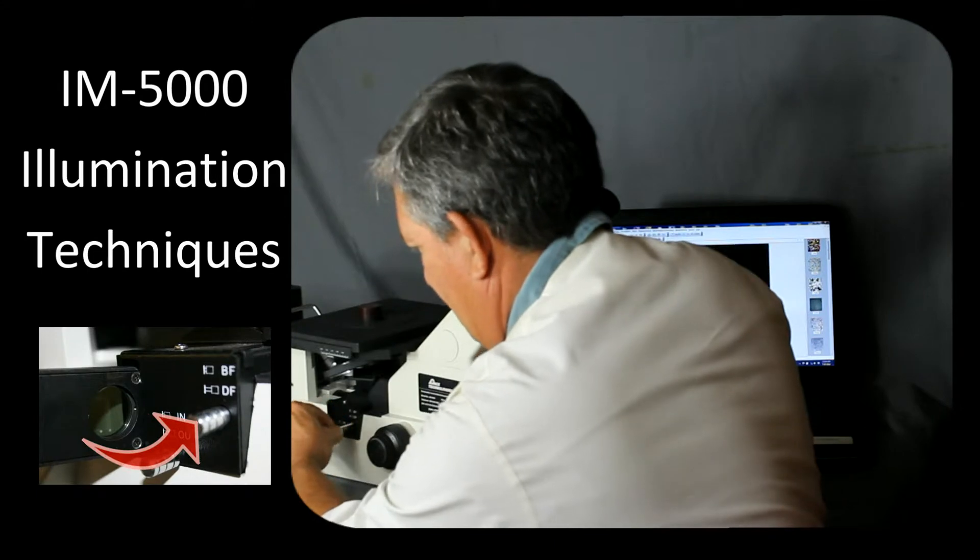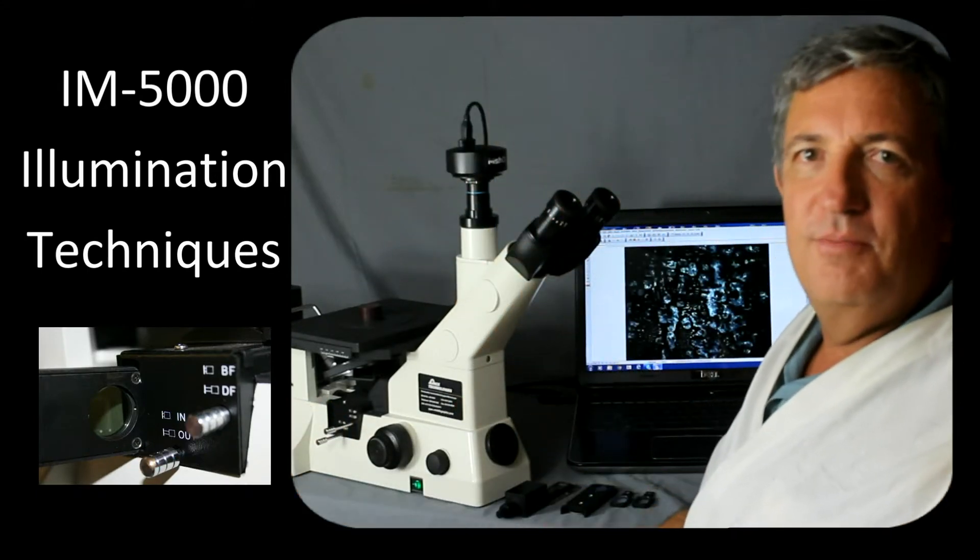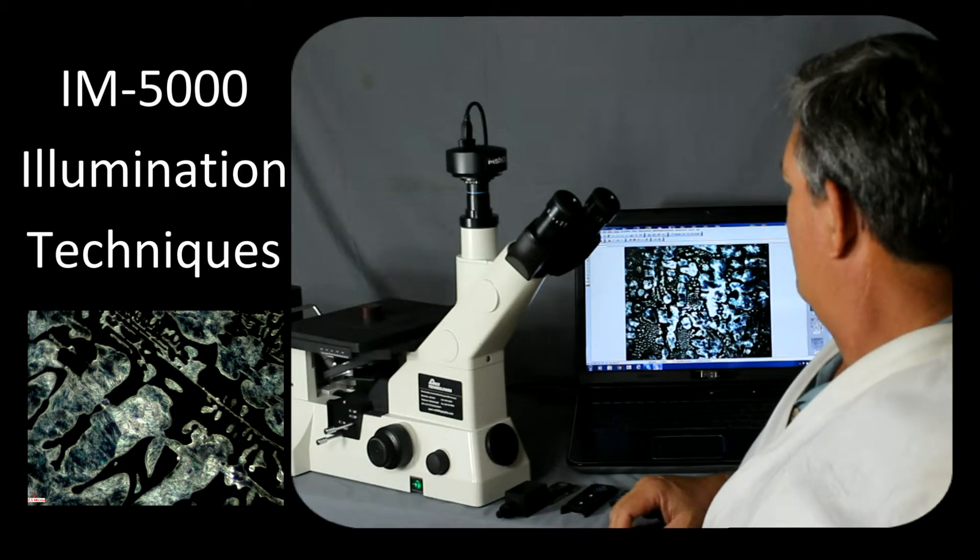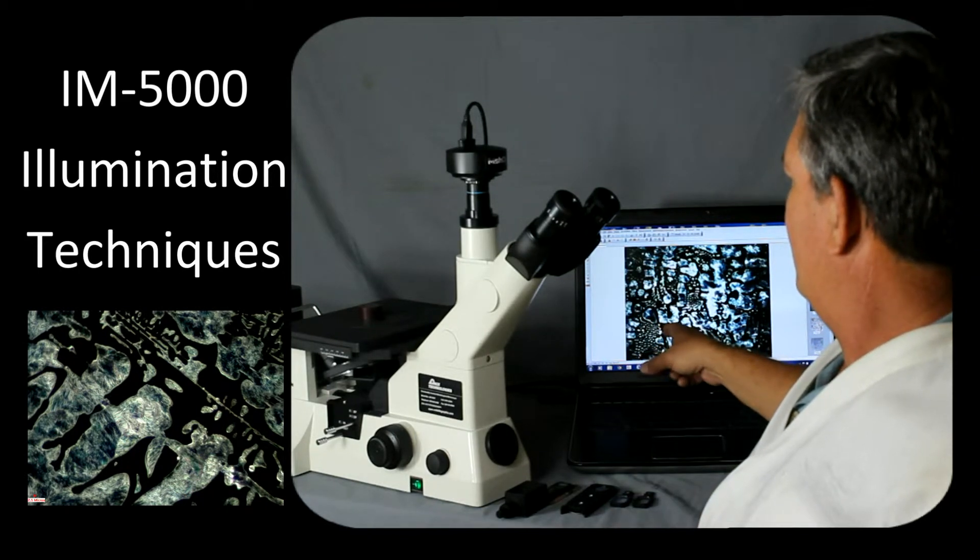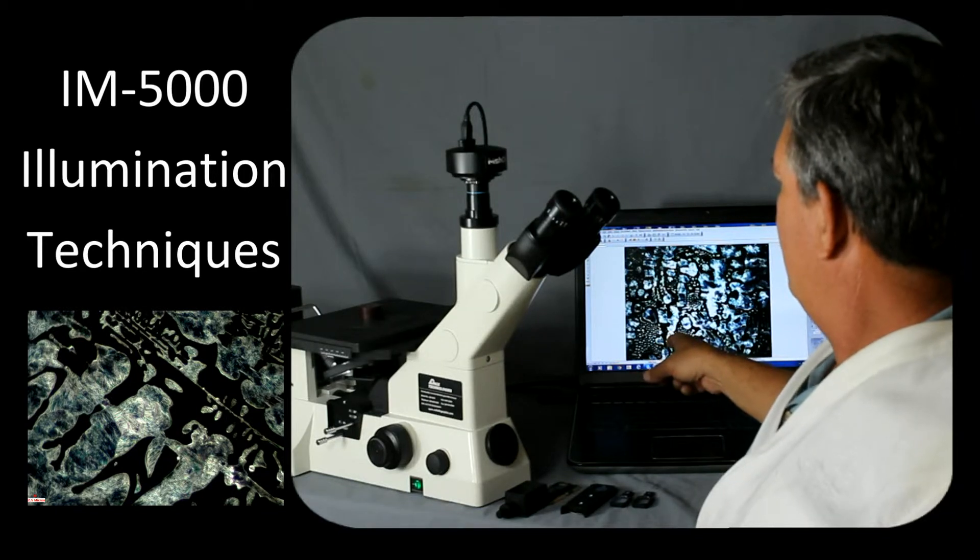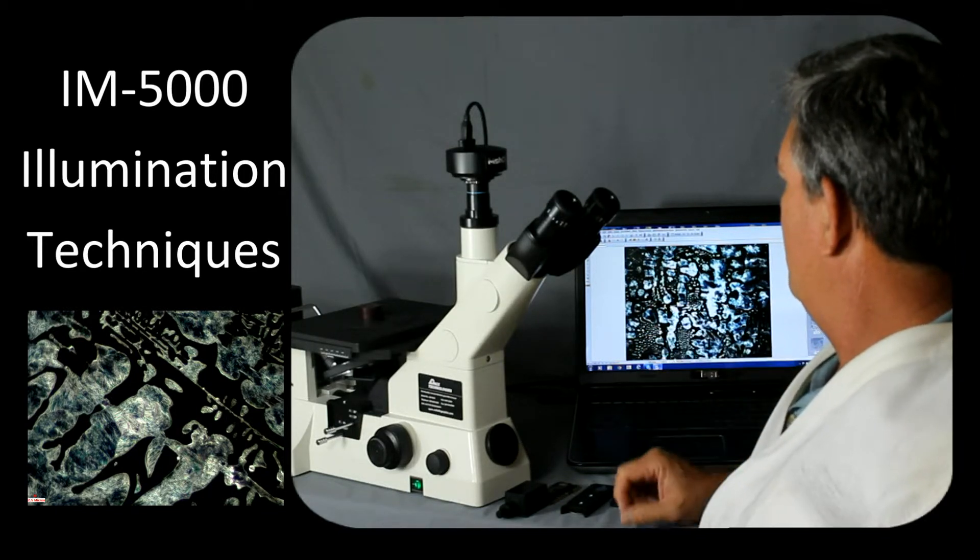By pulling out this lever here on the microscope, now we get to dark field illumination. And in this case what we've done is we've changed the optical path so that the background is going to be dark and the features are going to be bright.